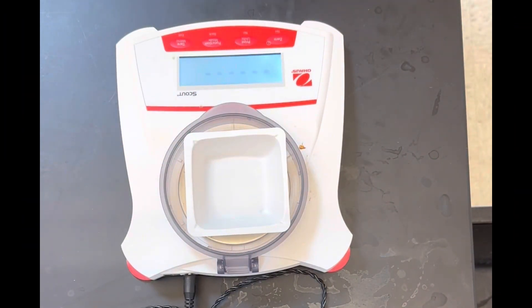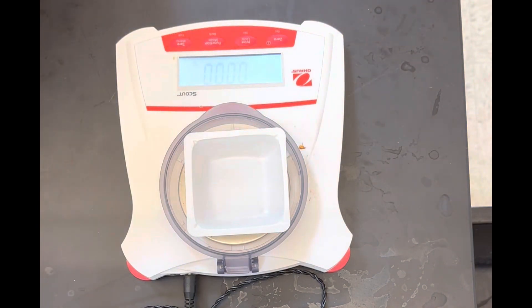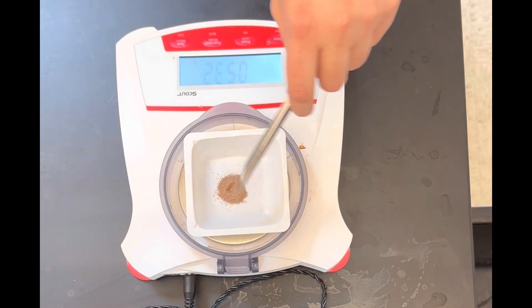First set the scale to zero, and then measure out your desired solid.